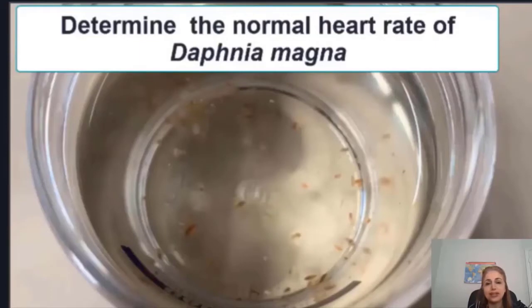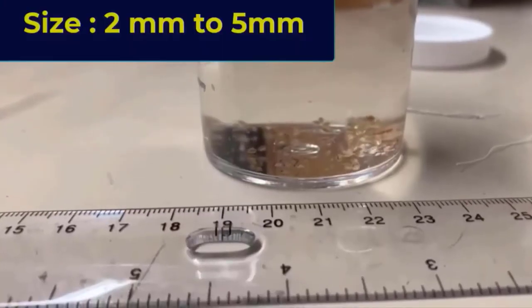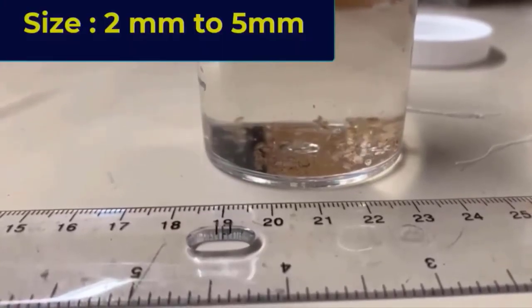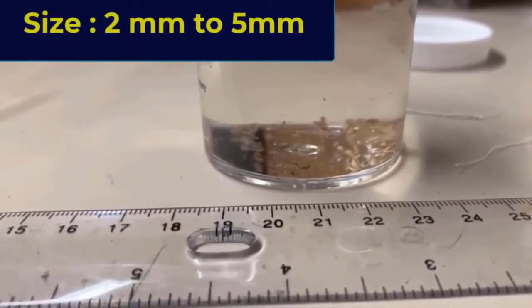A Daphnia is the water flea, a crustacean that lives in lakes or freshwater. It is also an excellent food source for fish. Their size is between two to five millimeters in length.